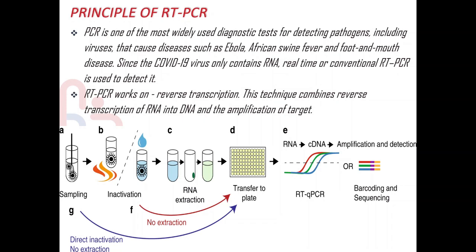The difference between running a PCR reaction on a gel and performing a real-time quantitative PCR is that the gel will give you only a yes or no answer. Traditional PCR won't be able to say how much we have, but an RTQ PCR can tell us.